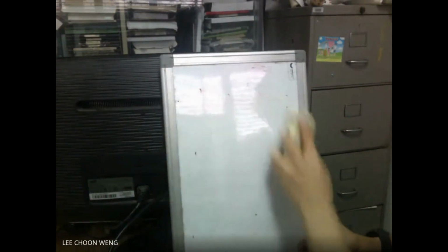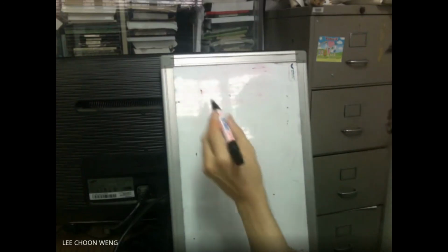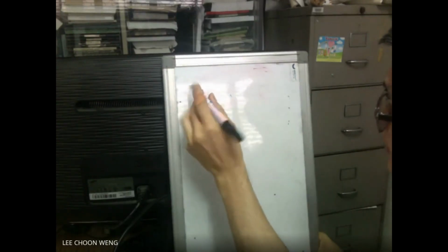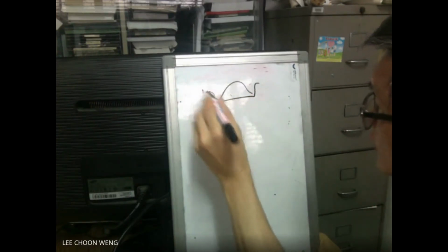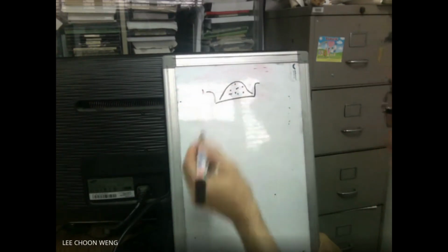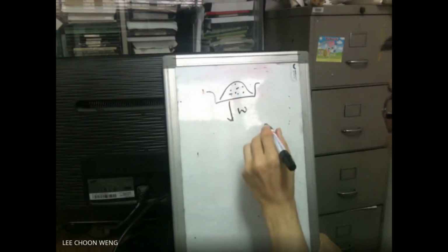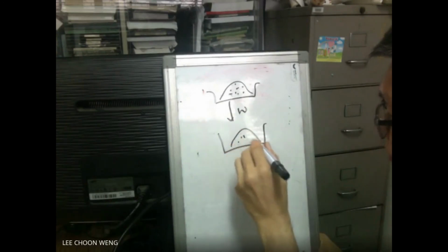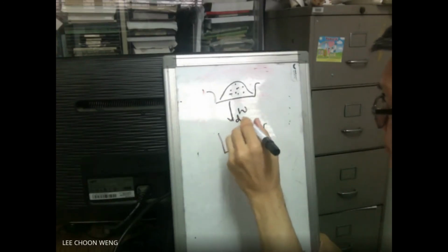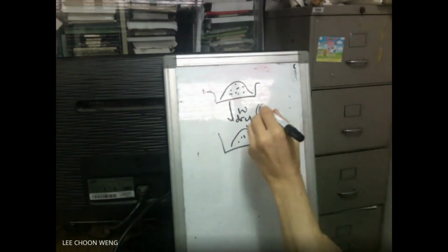So you also have a part where you are asked to take the soil, put it in aluminum foil, measure it, weigh it, and then dry it. When you dry, it can be air dry.